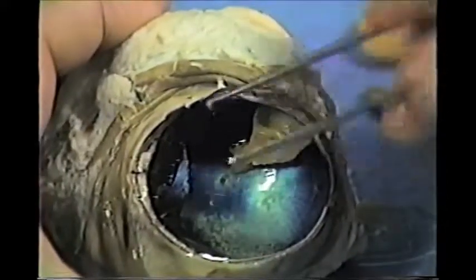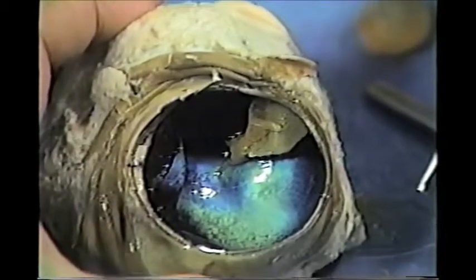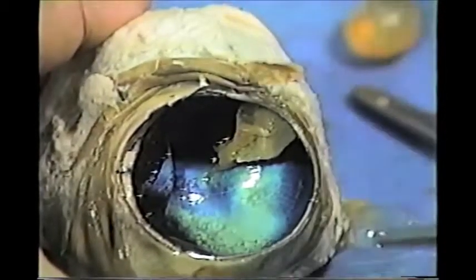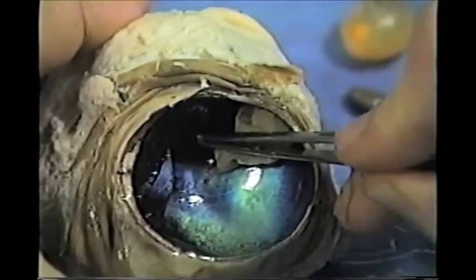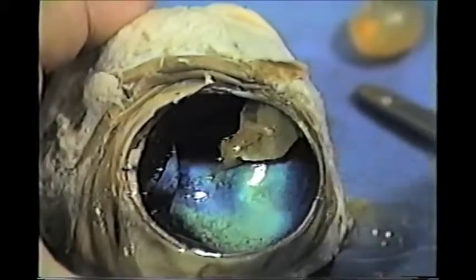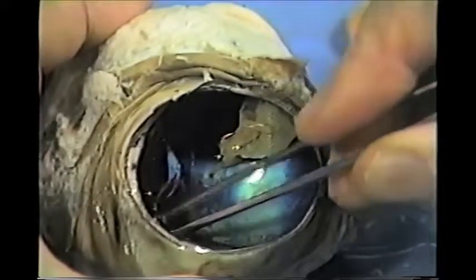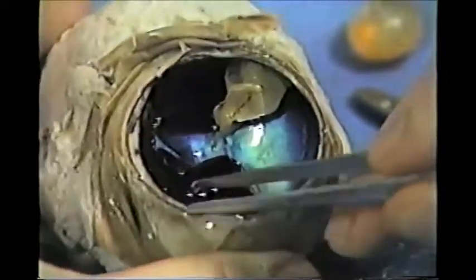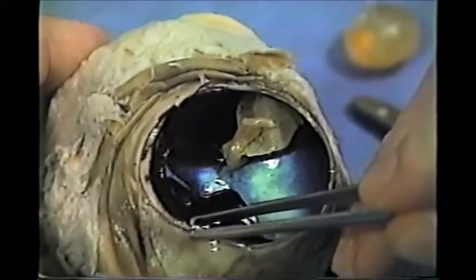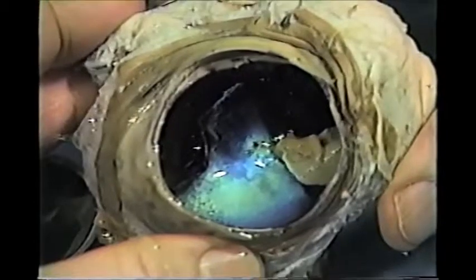The function of the choroid is to absorb light — just like the inside of a camera is always black to absorb light, we want the inside of our eyeball to be black. We want light to come in, stimulate the retina, and then get absorbed by the choroid. We do not want light bouncing around in our eyeball and overexposing the retina. If we peel the choroid back, what's left is the sclera — all of this tough part is the sclera, the white of the eye, and it's there primarily for protection. And that concludes the demonstration dissection of the eye.